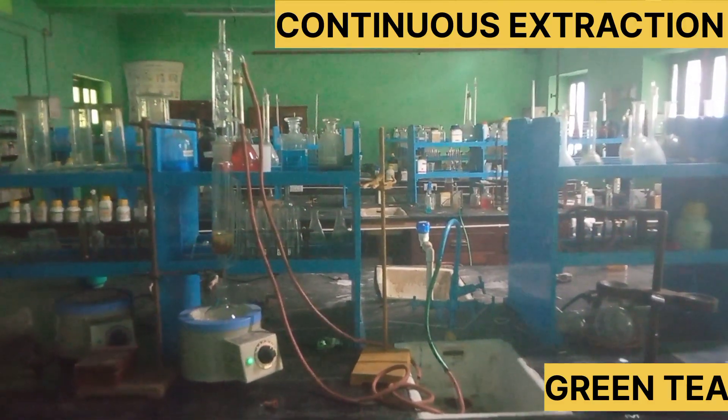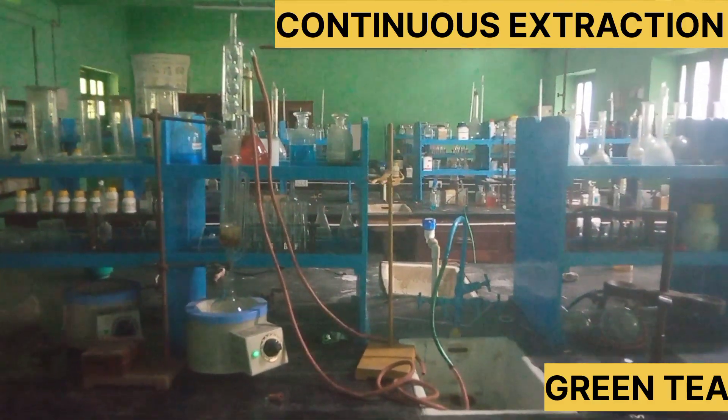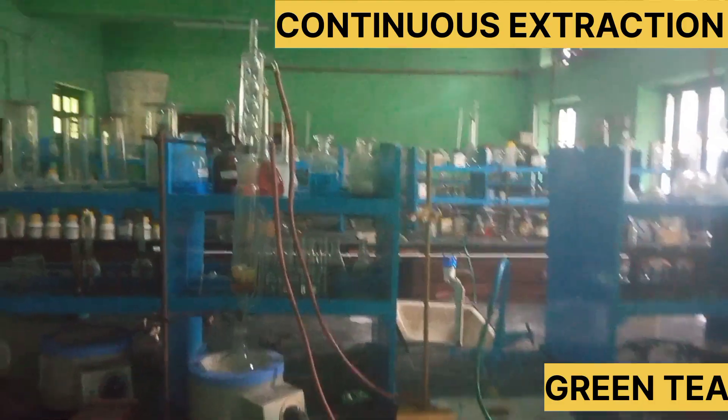Continuous Extraction is a method for solvent extraction. This method is used in IAGC.